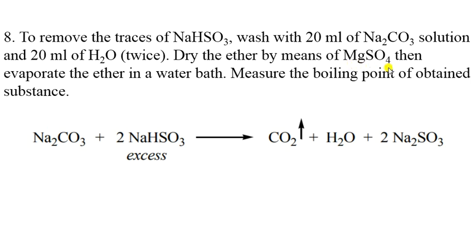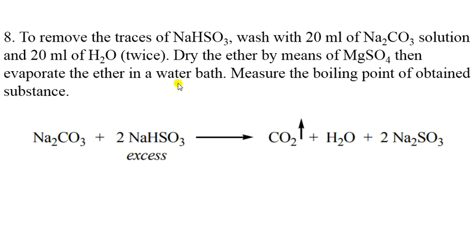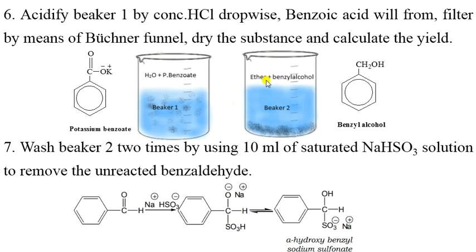MgSO4 as a drying agent, and then evaporate the ether in the water bath, so only benzyl alcohol will remain as a pure product.